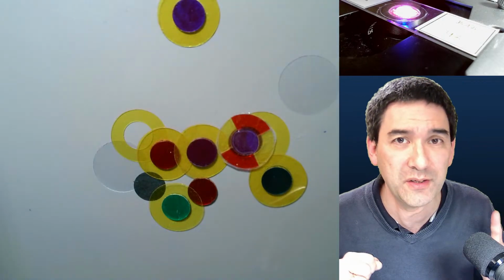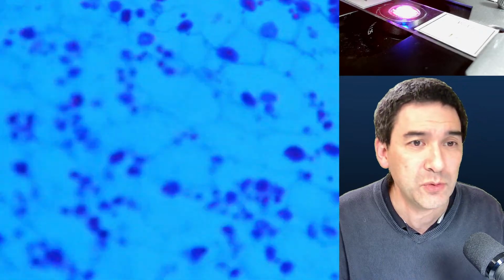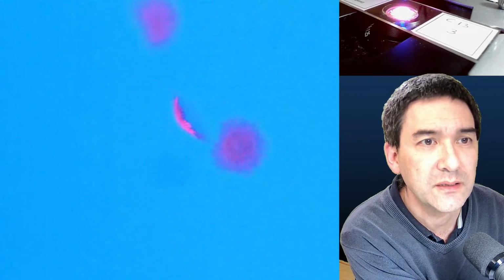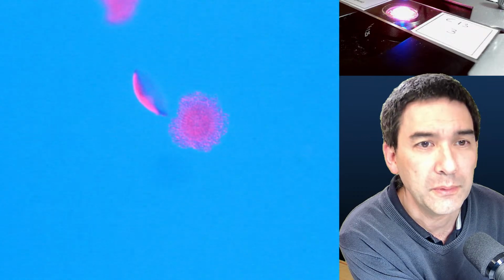And maybe because the one here is not the best type of specimen to illustrate this, I'm going to take this out. I'm going to show you a different one. I did prepare, what, 12 slides here? For example, this one over here. I already showed them to you last time. Radiolaria. Okay, so these are radiolarians, these are the shells of... Let's just use this here as an example. Let's open it up a little bit.